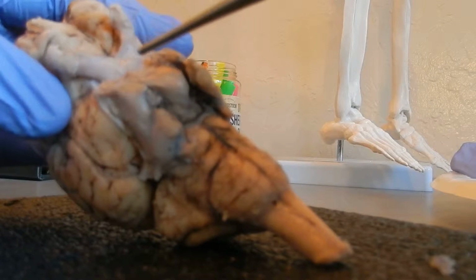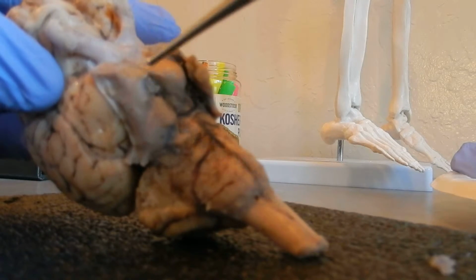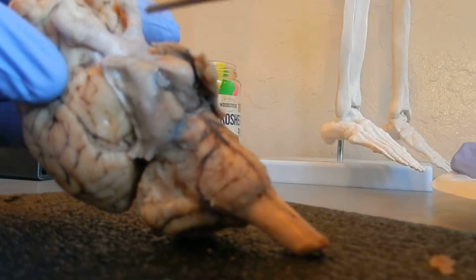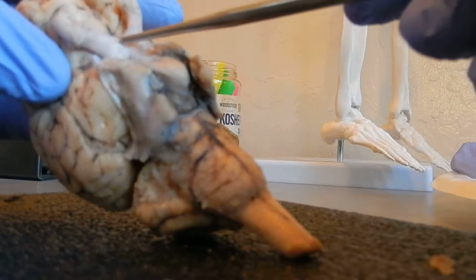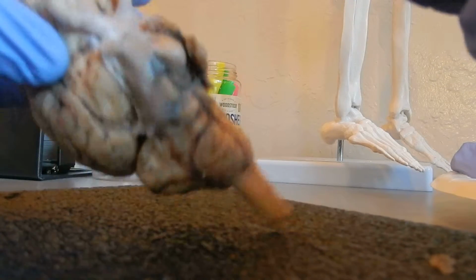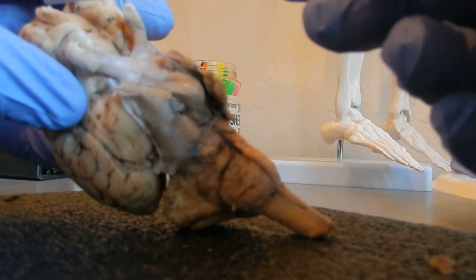After you go into the midbrain, we're going to look at the oculomotor, which is in this area here. And from the oculomotor, you have the optic tract. From the optic tract, we'll go up to the optic chiasma here, and then the optic nerve here. From the optic nerve, we'll go up here to the olfactory bulb in this area.